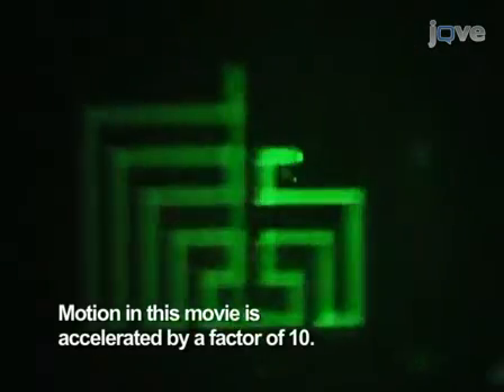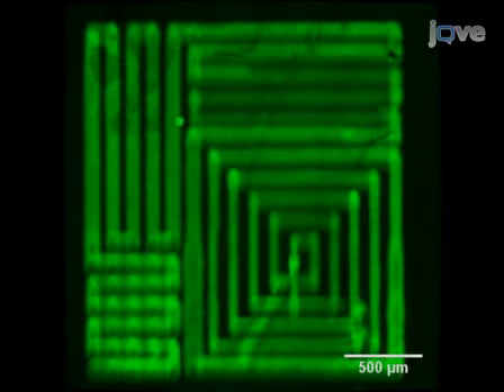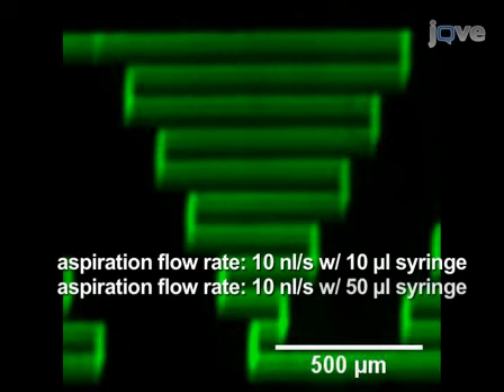Finally, the probe can now be used for a variety of applications. The surface patterns shown here were achieved by the MFP with fluorescein-labelled biotin on streptavidin-coated hydrogel glass slides. The injection flow rate was 1 nl per second and the aspiration flow rate was 10 nl per second, using 10 µl and 50 µl syringes respectively.